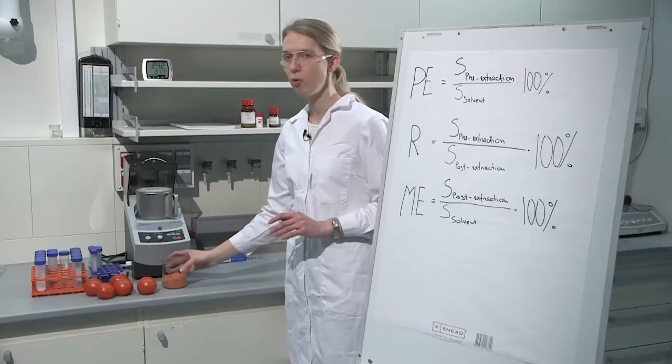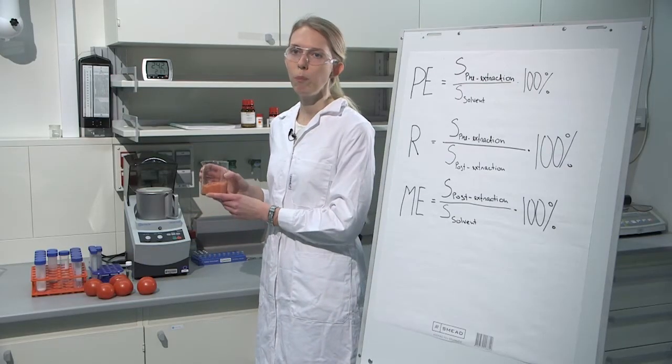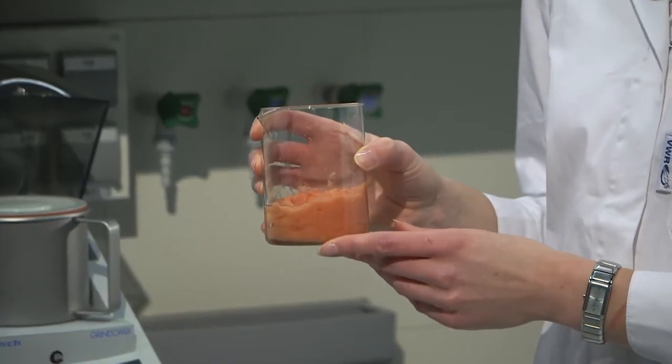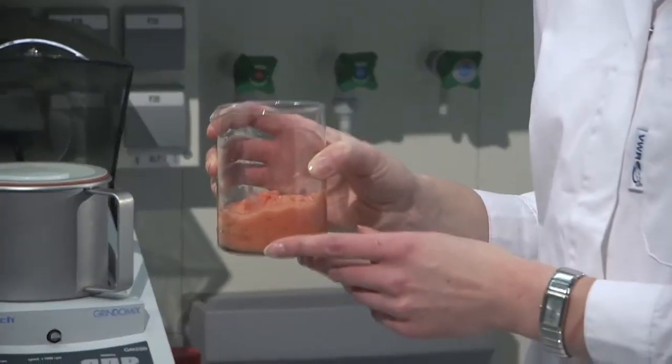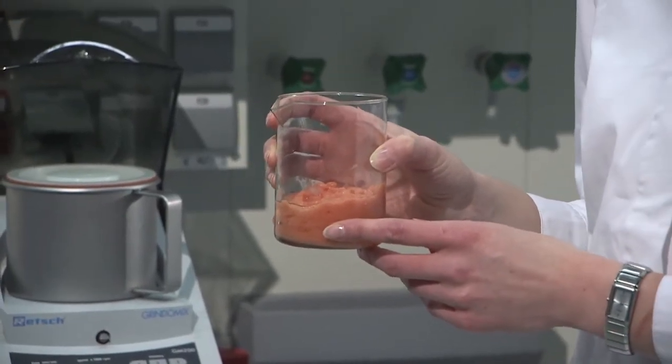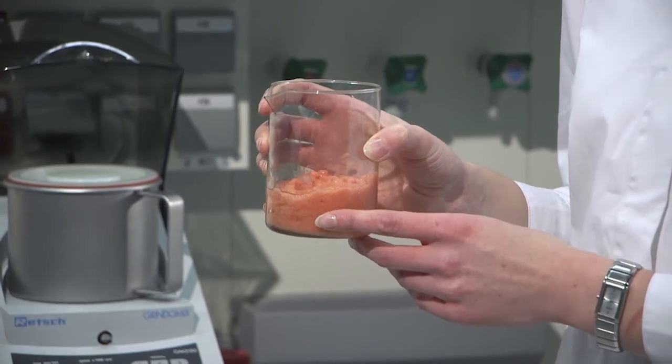Here we have already ready the blank homogenized tomato sample and we will start with spiking this sample. Before we can actually carry out the sample spiking, we should consider at what concentrations we are going to do this spiking.